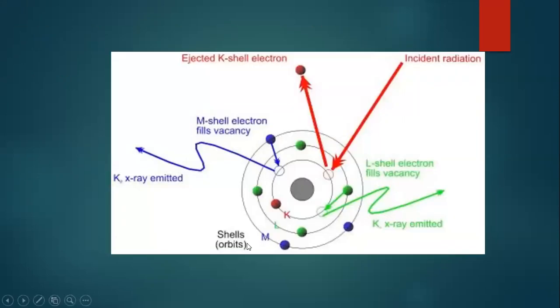Now, how the XRF works. This is a graph for the XRF process. An X-ray beam with enough energy affects the electrons here, the inner shell of the atoms. The X-ray beam is created in the sample by what's called the X-ray tube inside the handheld analyzer.